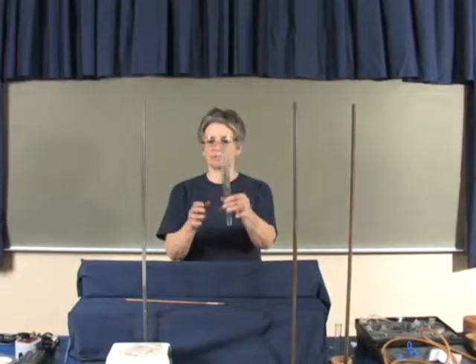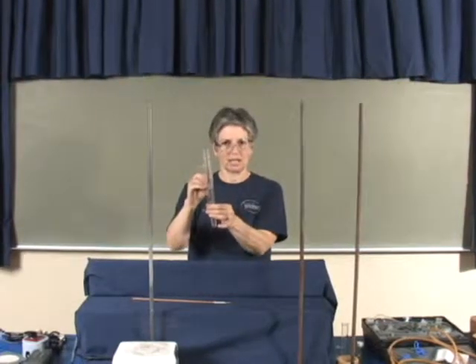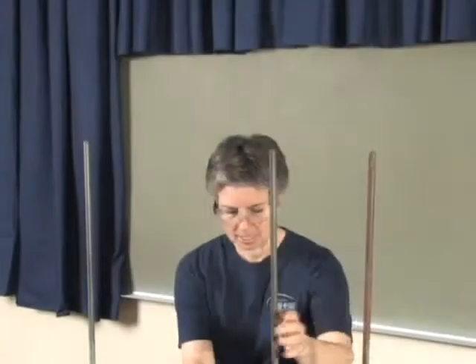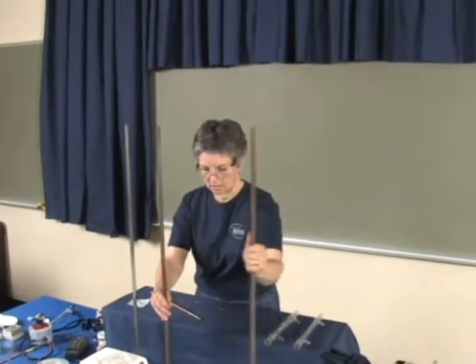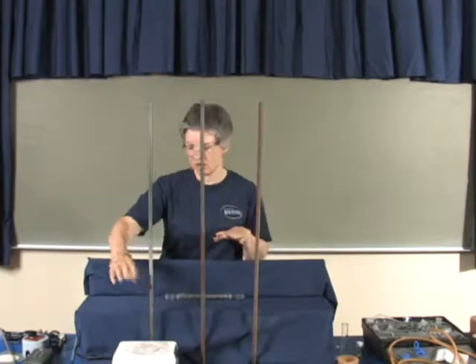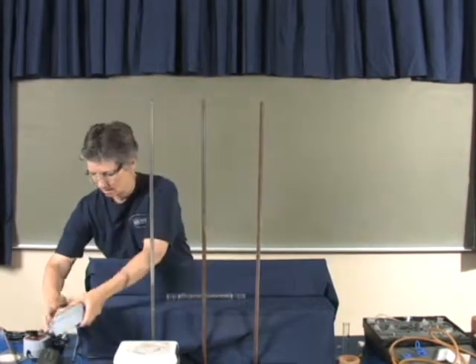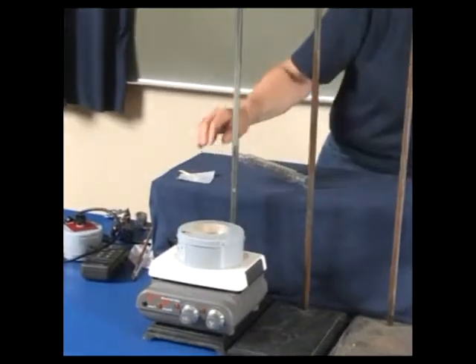When it's completely filled, you should be able to see a lot of light through it. You don't want the packing too heavy, but you also don't want it too spread out. To set up the apparatus, you start with the hot plate to set your height and an appropriate sized heating mantle, and your round bottom flask goes in the heating mantle.